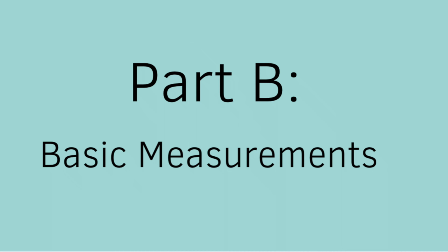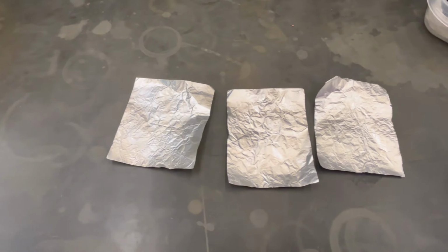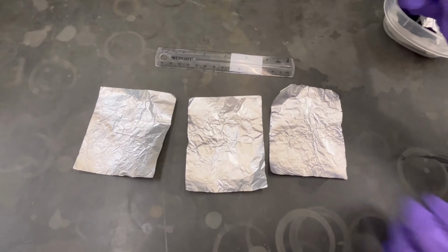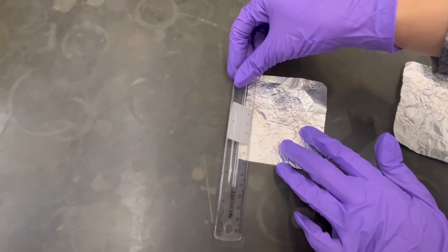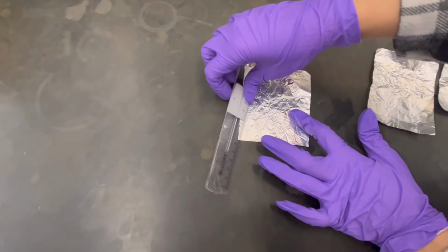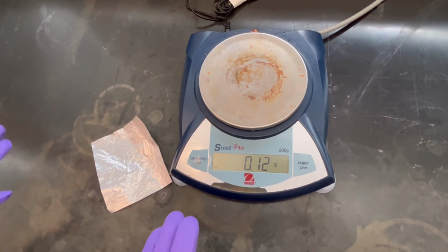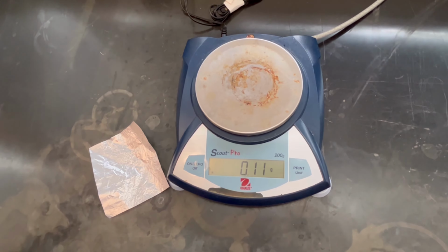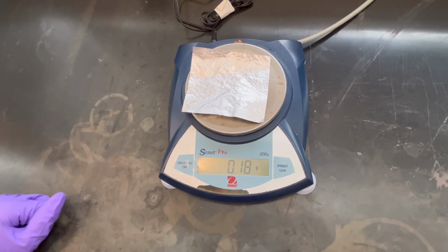Part B, basic measurements, aluminum foil. For this part, we will need 3 aluminum foils and a ruler. First, we will need to measure the width for each aluminum foil using the centimeter part of the ruler, and the length. Then going to the balance, we are gonna zero the balance first and then measure the mass of our aluminum foil.